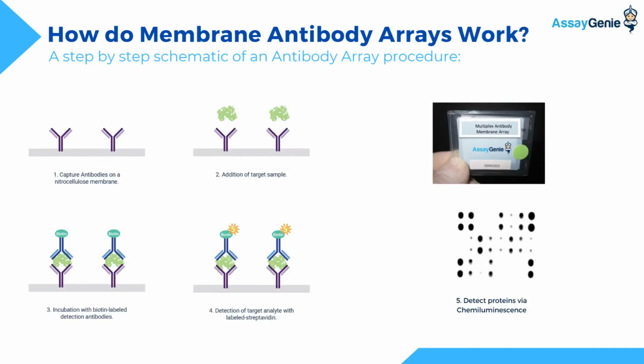Here's a step-by-step overview of how membrane antibody arrays work. 1. Prepare your sample. 2. Apply the sample to the membrane. 3. Incubate with detection reagents. 4. Wash away unbound material. 5. Detect proteins via chemiluminescence.